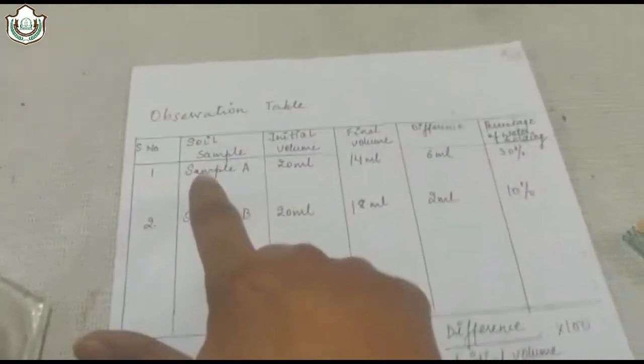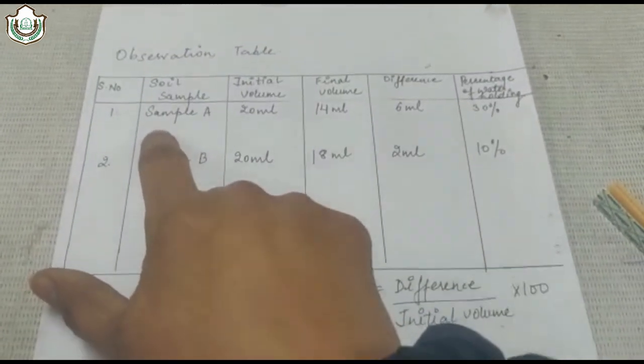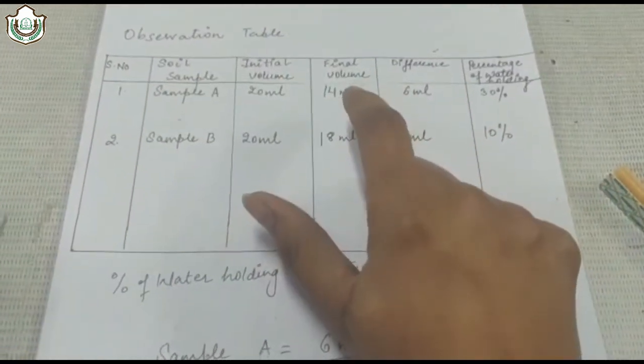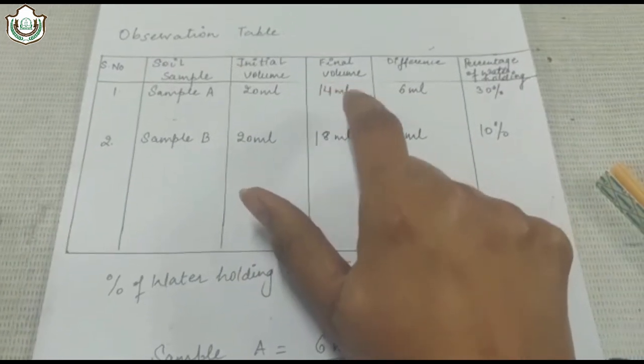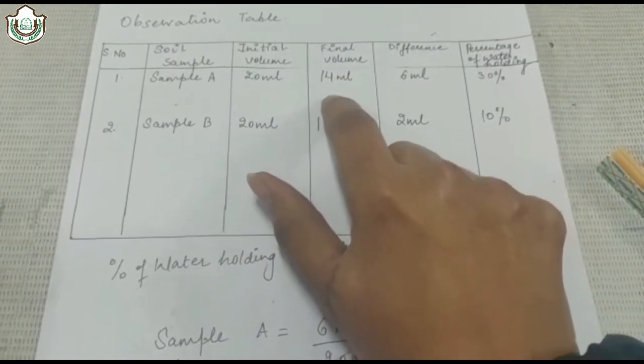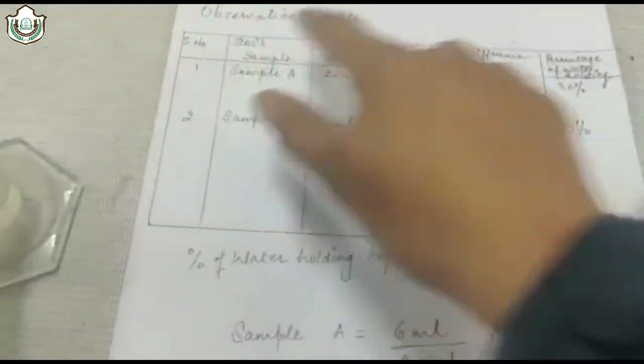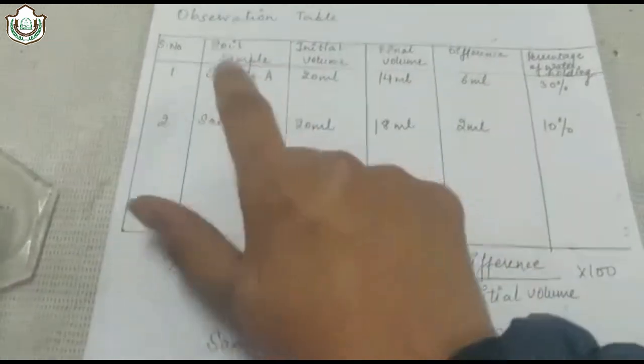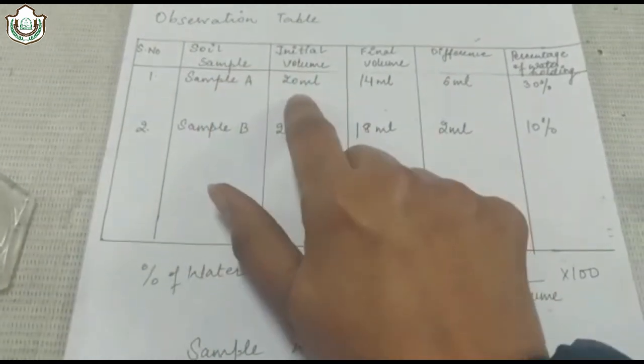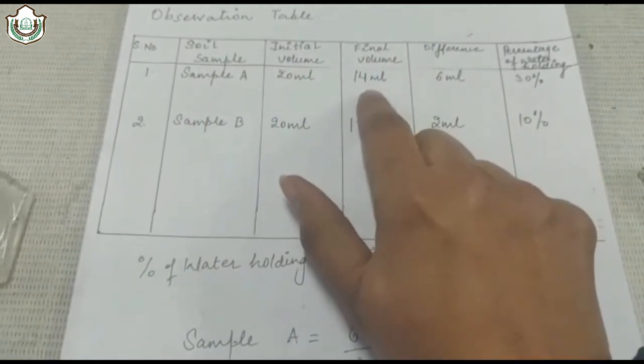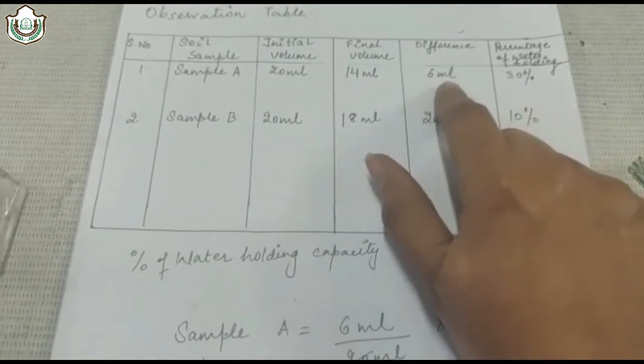After that, you will find that the final volume of sample A is 14 ml and sample B is 18 ml. Now you draw the observation table. Sample A initial volume is 20 ml, final volume is 14 ml, and the difference is 6 ml.